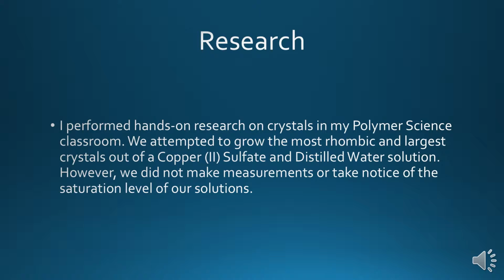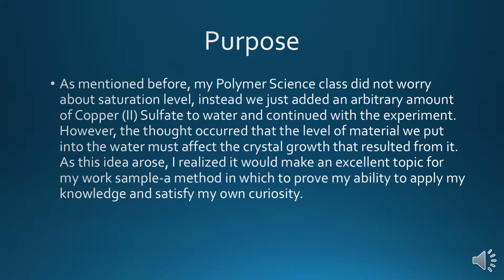However, we did not make measurements or take notice of the saturation levels of our solutions. As mentioned before, my polymer science class did not worry about saturation level. Instead, we just added an arbitrary amount of copper-2 sulfate to water and continued with the experiment.